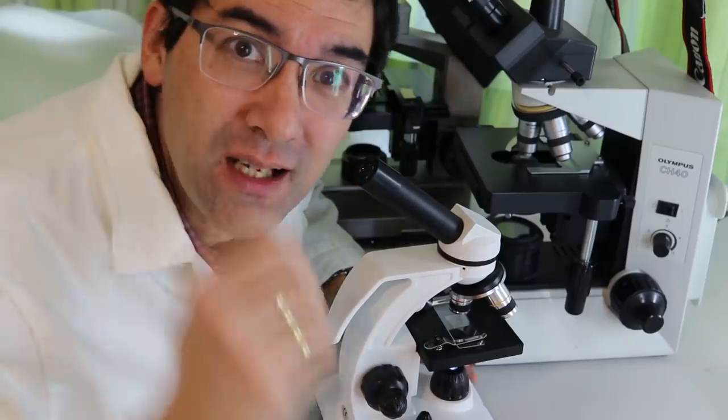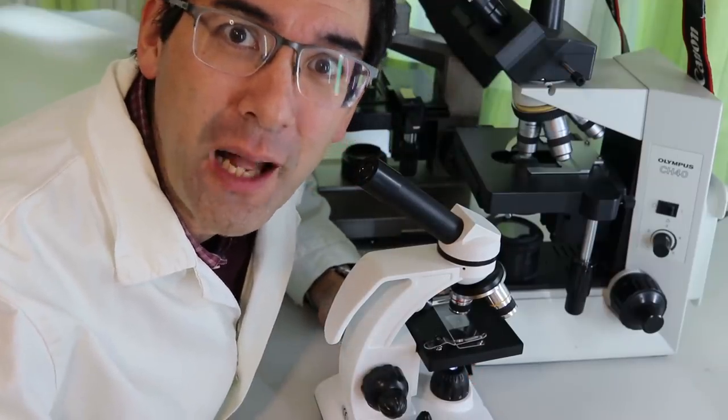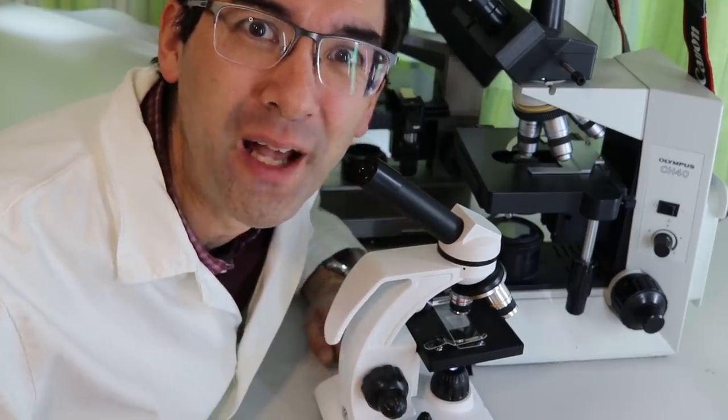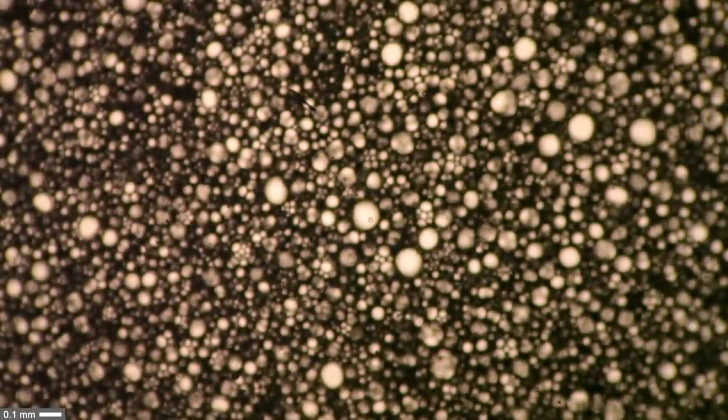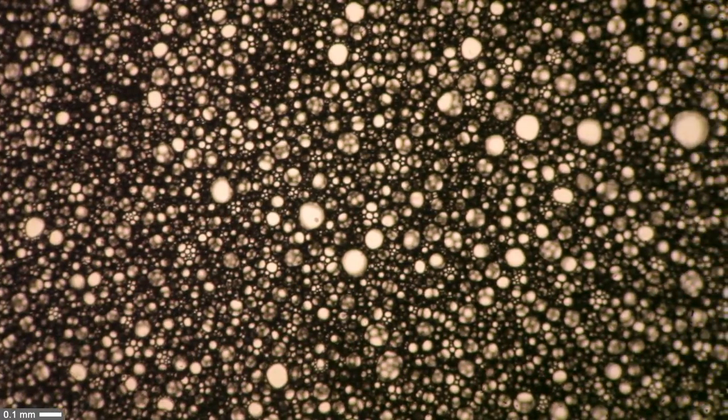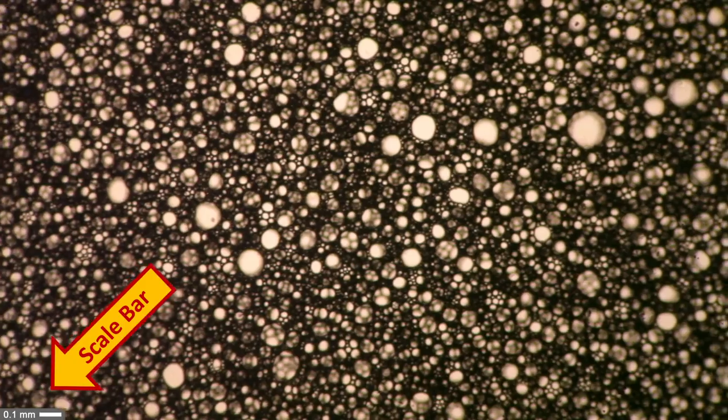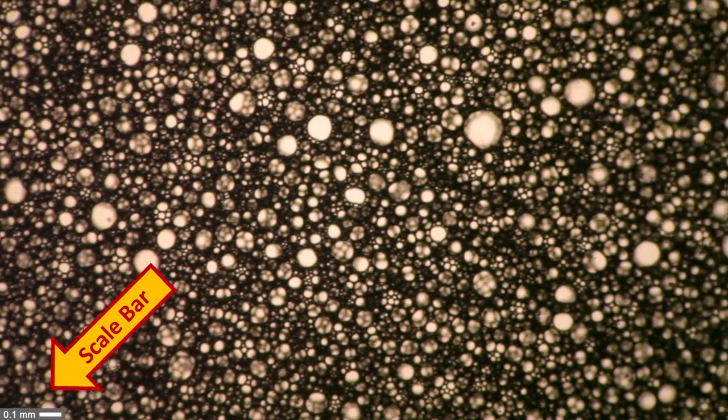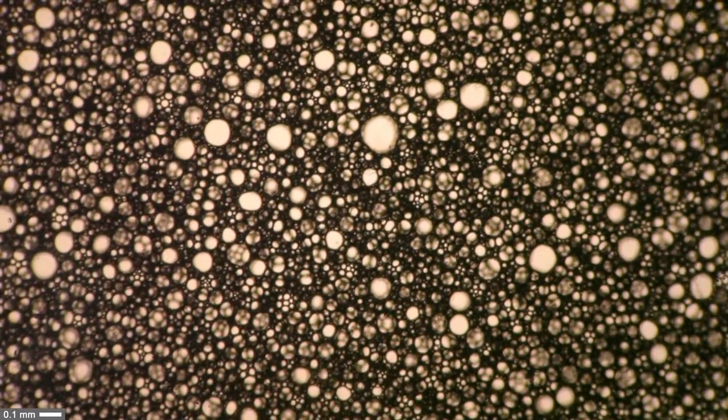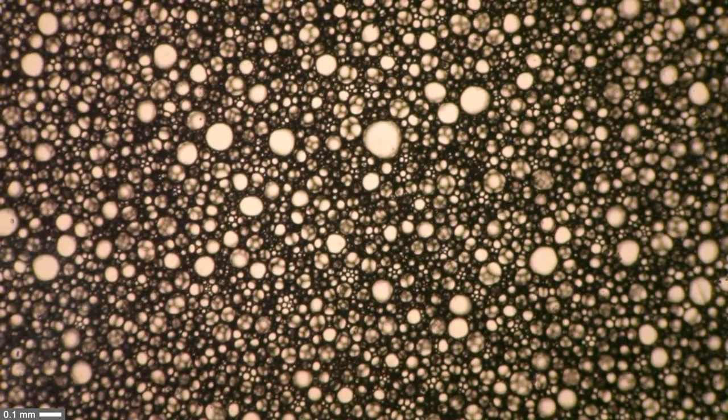I do see a lot of bubbles but what I'm going to do now is switch over to my larger microscope so I can show you what I see. Let's focus a little bit. That is foam under the microscope. Notice there is a small scale bar on the bottom left, so you can see that the larger foam bubbles have a size of approximately 0.1 millimeters. And that's time-lapse right now.